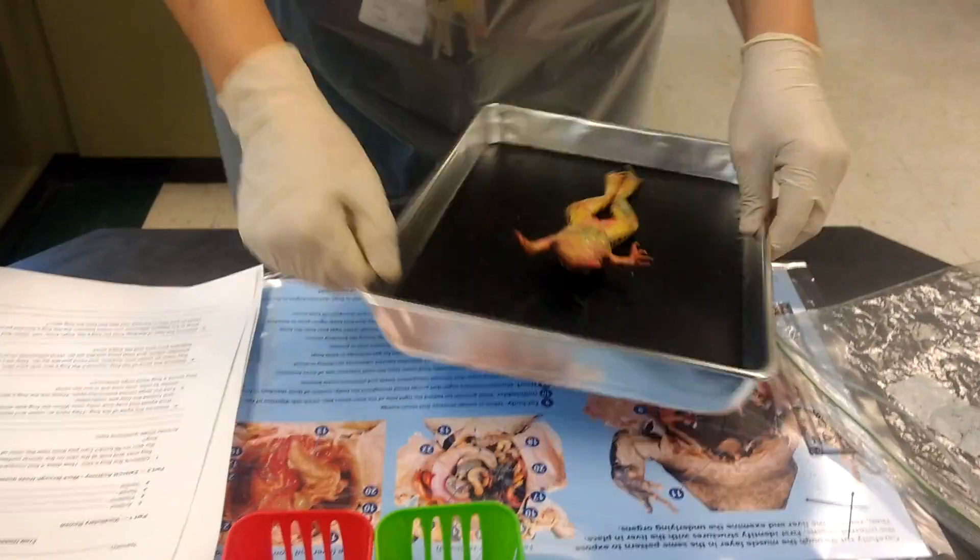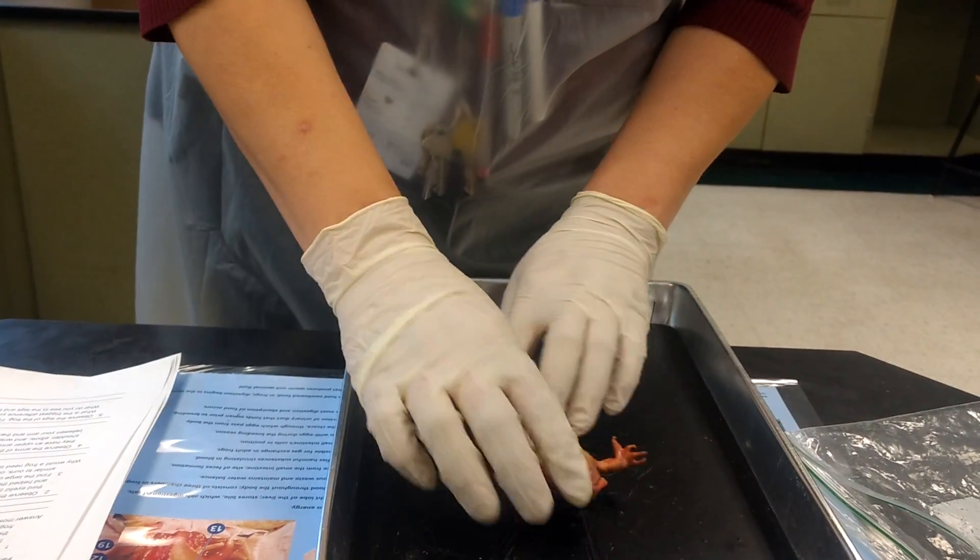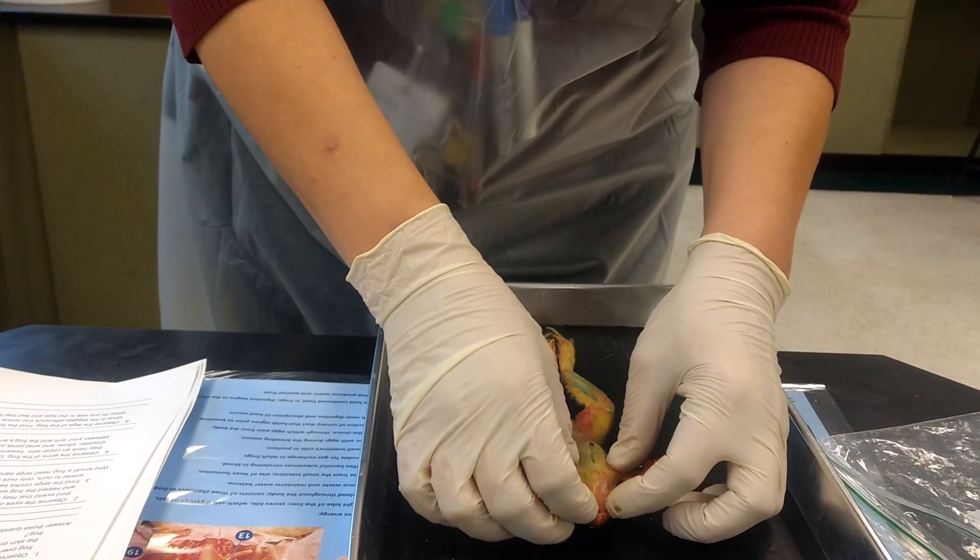He's very stiff because he's gone through rigor mortis. Before we do the body, we're actually going to look into the mouth first.